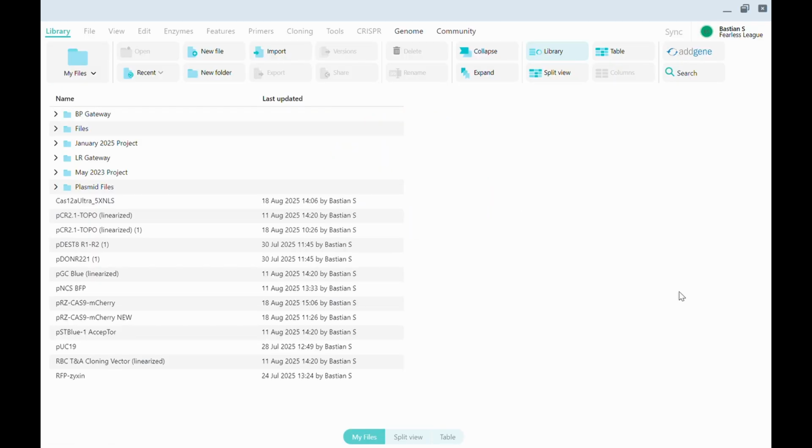Welcome to this tutorial on CRISPR-Cas tools in Photo51. Today we will go over how to identify PAM sites and get the corresponding guide RNA for both traditional Cas systems and base editing systems.